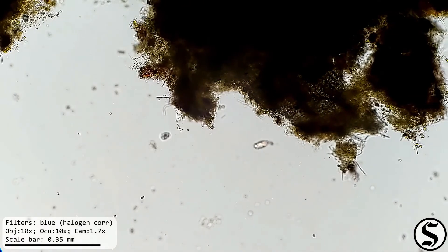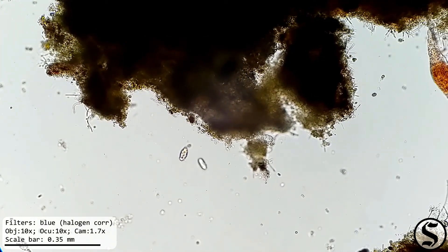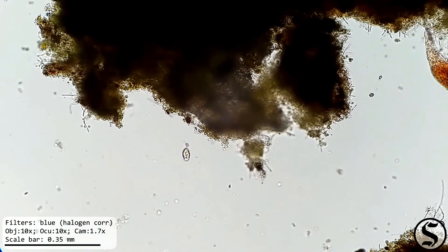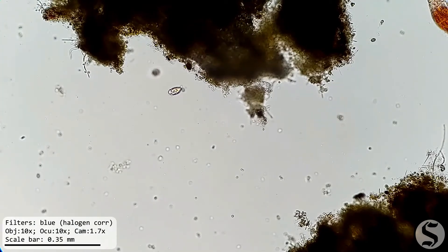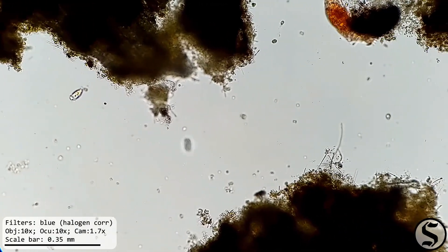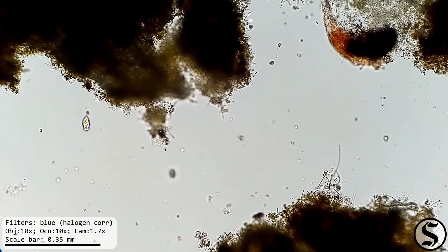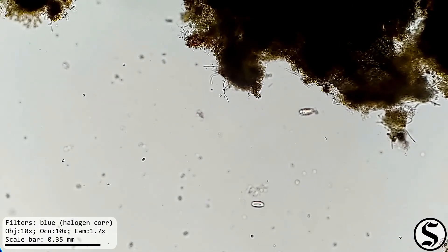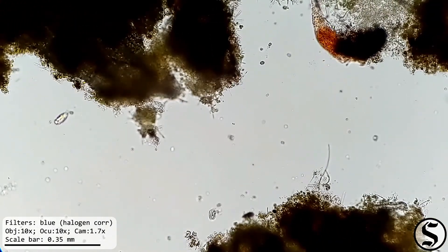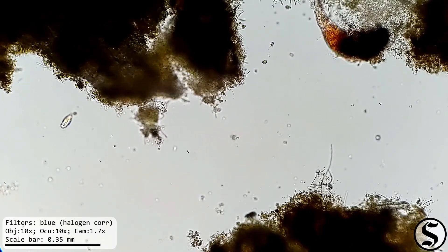Well, I thought it was really neat to be able to check back in on Birdbath A, see the things that are currently going on in there. I was kind of surprised that we didn't see any hypotrichs, but it's possible I just didn't have them in this sample. This is a very small amount of water that we're actually looking at here on the slide. And I was really excited to be able to catch an Opercularia telotroch coming off of its stalk and swarming around.